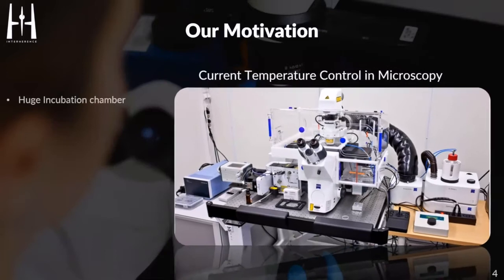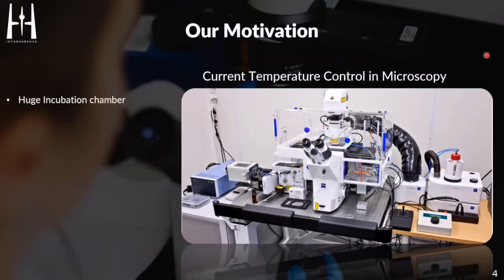And this system has some issues or drawbacks which I would like to mention now. First of all, the chamber is very huge, so this makes the reaction time very long concerning temperature changes in your volume, in your sample.